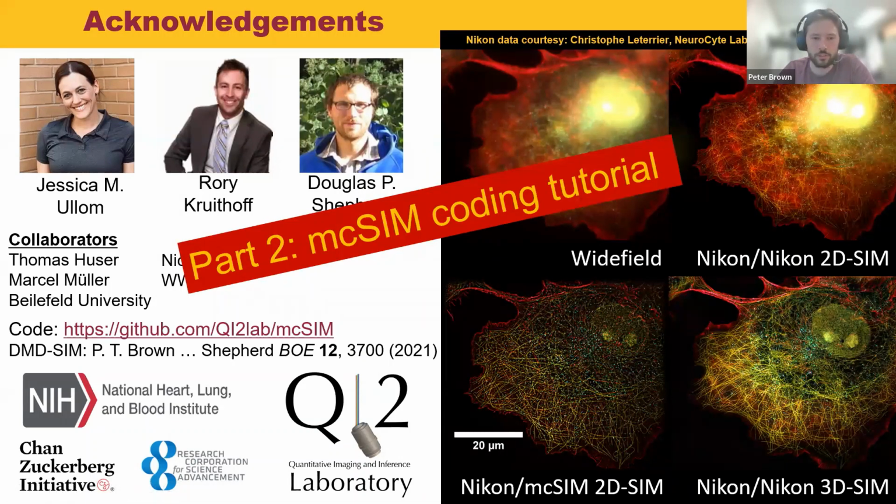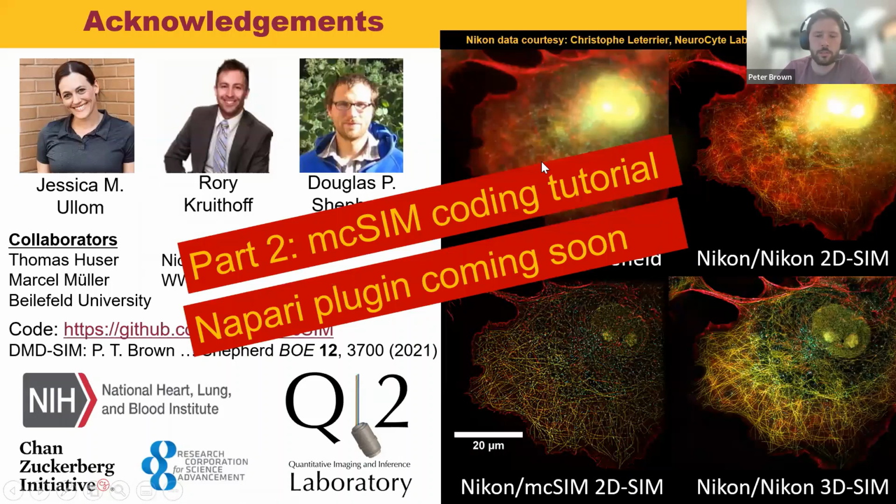I encourage you to check out part 2 of this tutorial, which is a coding tutorial that Doug is giving. And also, please stay tuned. We are working hard on a Napari plugin to simplify the use of mcSIM even further. So that will be coming in the near future.